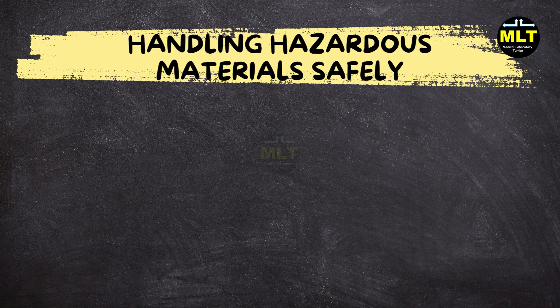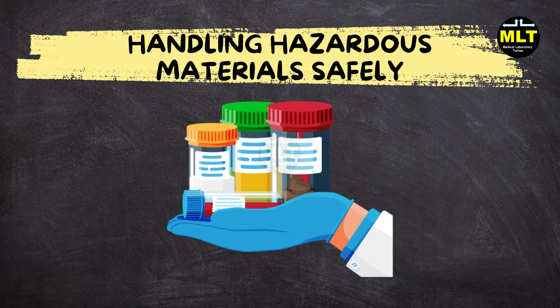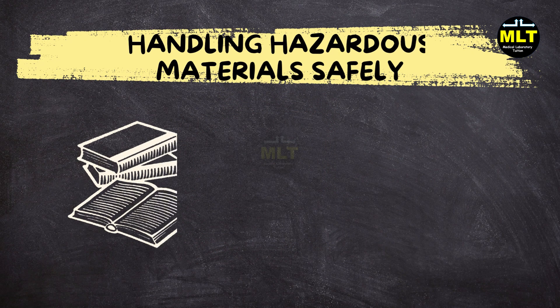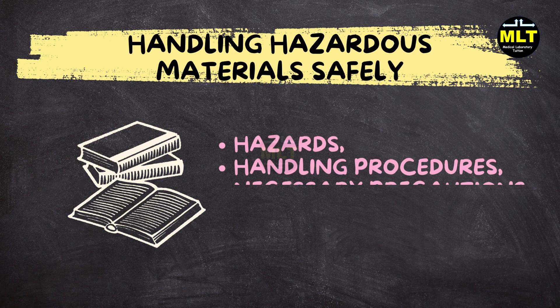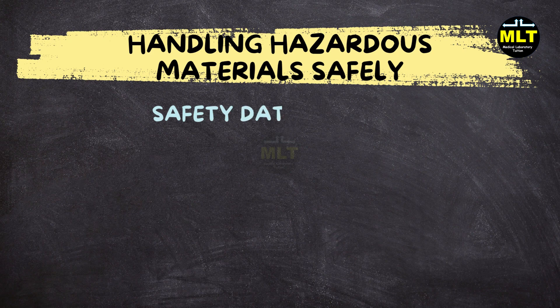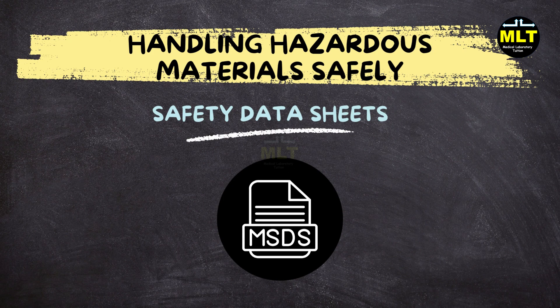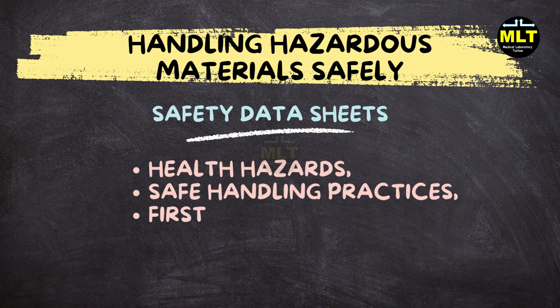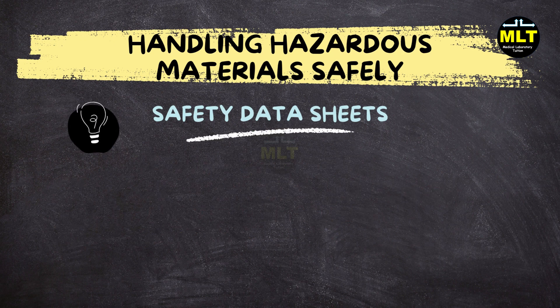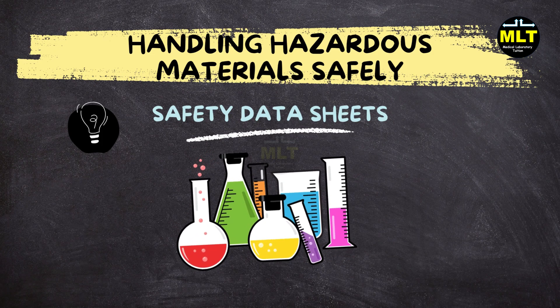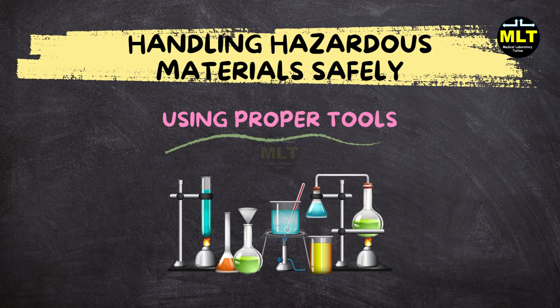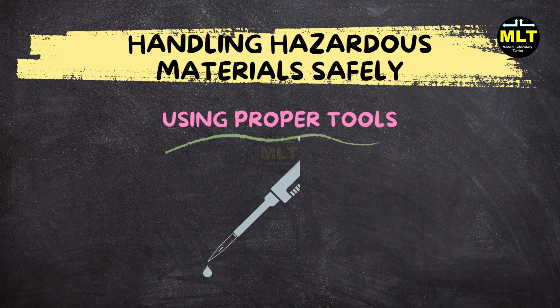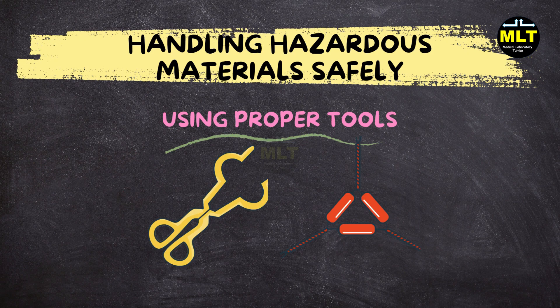Section 3: Handling Hazardous Materials Safely. Handling hazardous materials safely is important to avoid any accidents. Reading labels: Always read labels on chemicals and biological samples. Labels provide essential information about hazards, handling procedures, and necessary precautions. Safety Data Sheets (SDS): Familiarize yourself with SDS for each chemical you use. SDS contain critical information on health hazards, safe handling practices, and first aid measures in case of exposure. Tip: Create a quick reference guide for commonly used chemicals in your lab, summarizing key SDS information for easy access. Using proper tools: Employ the correct tools and techniques to minimize spills and accidents. For instance, proper pipetting techniques can help avoid spills when transferring liquids. Always use tools designed for the specific task at hand.